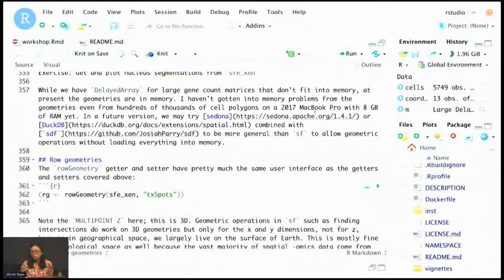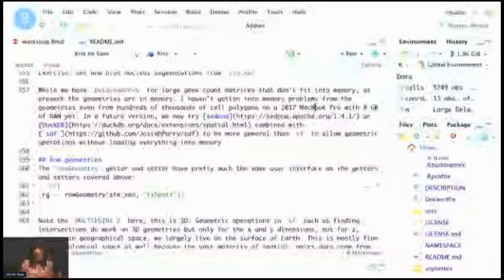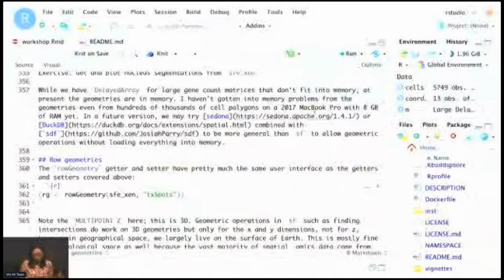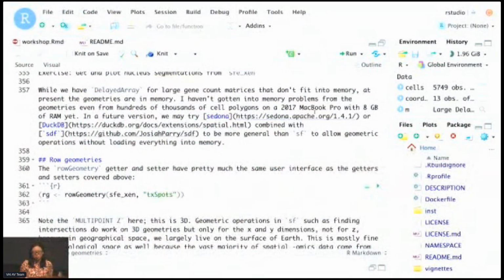And then Beneath wants to know, how do you set your thresholds for transcripts and genes? What do you mean by threshold? Oh, so in this case, I just removed the transcripts and the genes that are not detected. But in this vignette it's kind of arbitrary. I think some more expertise about the tissue of interest could help.